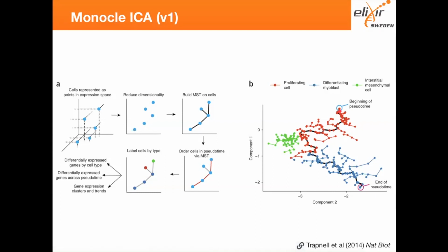That means that all those, let's say 1,000 genes, are very similar to each other, and their distance here will be very close. So you want to find the closest neighbor of this cell to that one, but not only at the local site; considering that you have to connect every single point, the distance between all the points should be very minimal.